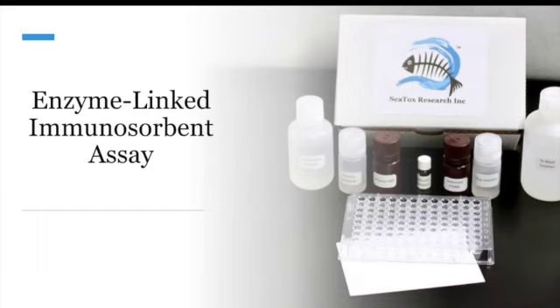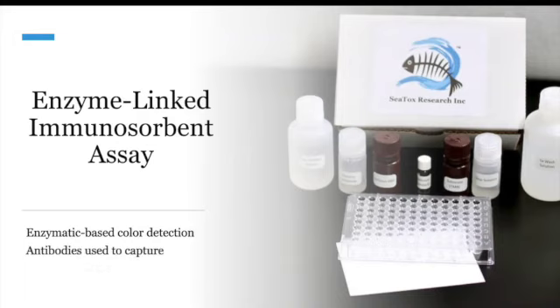The first is enzyme. Enzymes are biological catalysts, and in this case, it's a protein that speeds up a reaction. It's the enzyme that causes the color change that allows you to see whether or not there is toxin in your sample. The second part is immunosorbent, or immune. Think of your immune system. Immunosorbent refers to antibodies that attach to antigens, and for this assay, the antigen is the toxin.